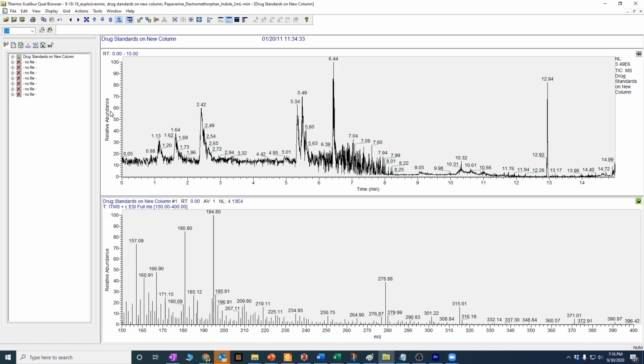But it has to pick something. It has to pick a way to display Y intensity on the chromatogram. So the default is, again, going to be the total ion chromatogram. The default is not going to be, oh, pick the tallest peak. And so the tallest peak here has an intensity of 4.13 times 10 to the 4th. That is not what the default typically is with most software with mass spectrometry. It's called the total ion chromatogram.